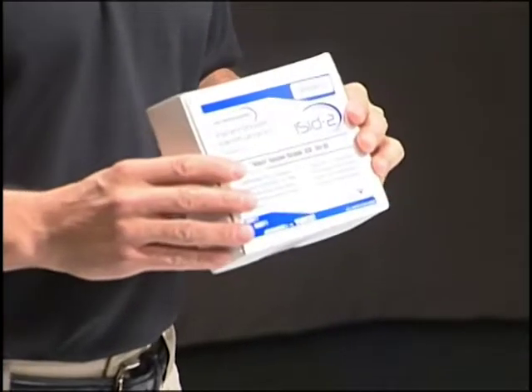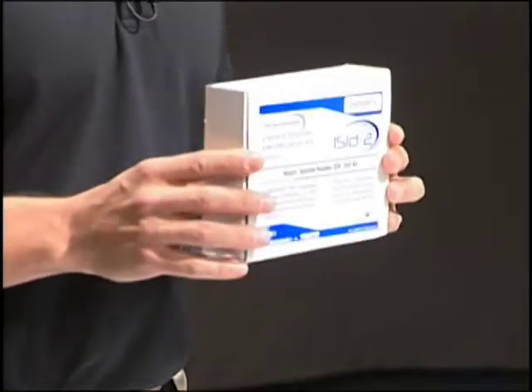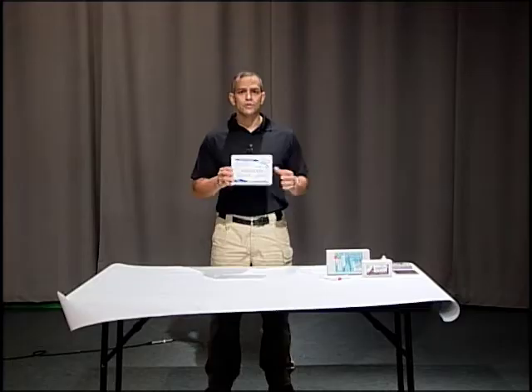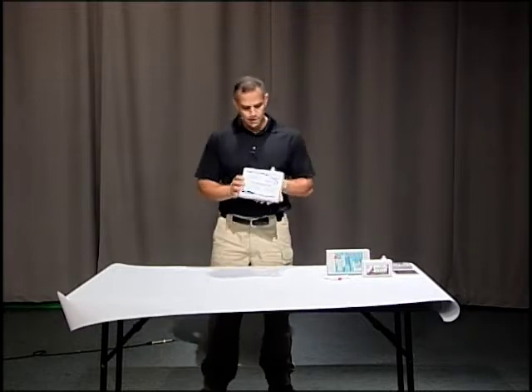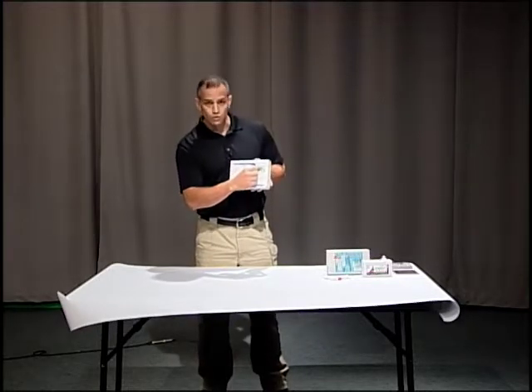The kit I'm going to show you today has two different applications. One is a sample that we're going to send to the lab, and the other is a presumptive test you can do out in the field. This kit has category 2 on it.